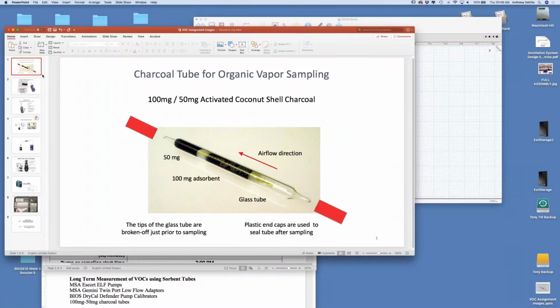This video is going to review the various methods we use for sampling organic vapors in class, and it'll also be kind of a preparation for you for assignment 5, when you have to submit some results for VOC calculations.